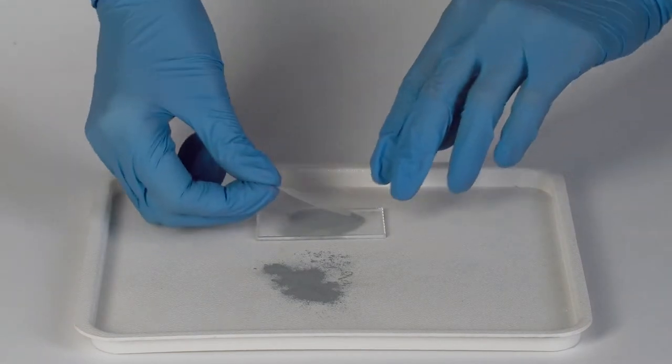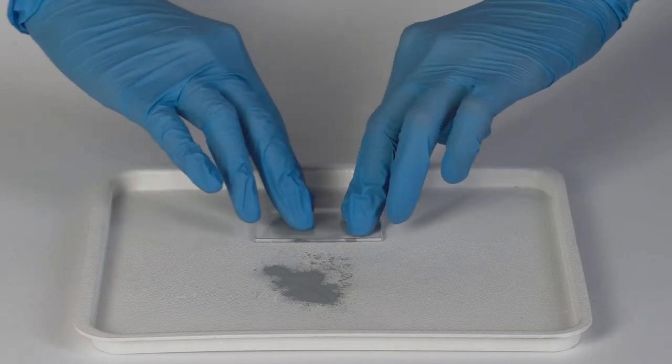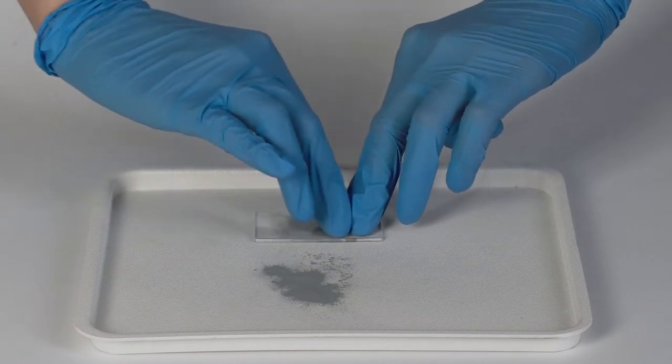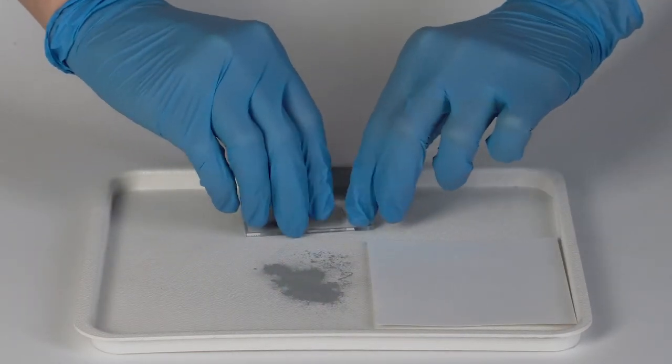Turn the glass slide over again and place a piece of adhesive tape over the fingerprint. Carefully pull off the tape and stick it onto a sheet of white paper.